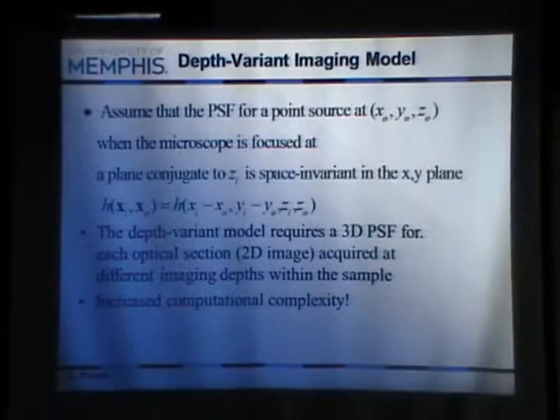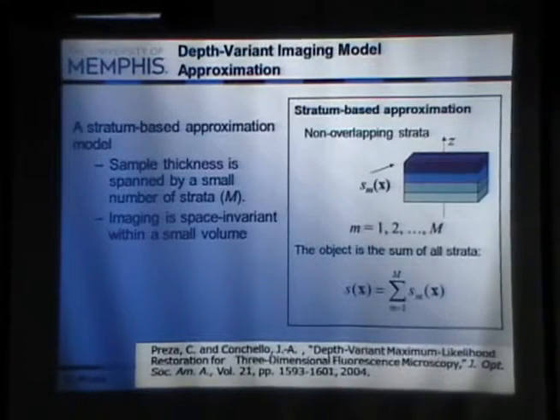So this is what we then decided to do. And this was something that we conceptualized a long time ago, but now in the last few years we're able to really apply it. To initially make this problem tractable, we took the idea that we can perhaps look at different sub-volumes, okay, in the object space. So consider this as being the object that we're studying. And we're going to fragment it in sub-volumes. You see here little slabs, or I call them the strata.